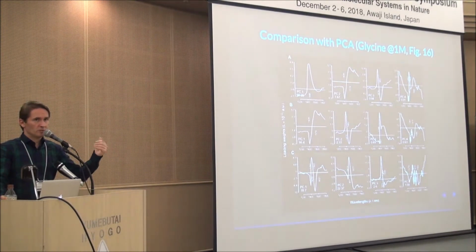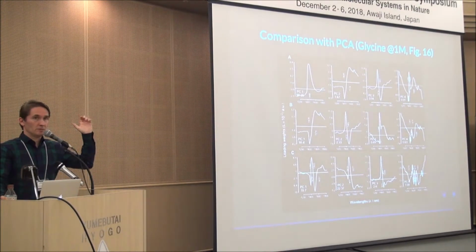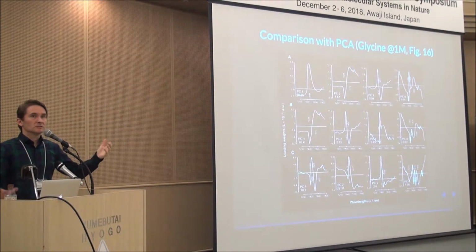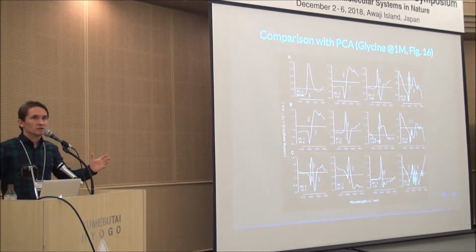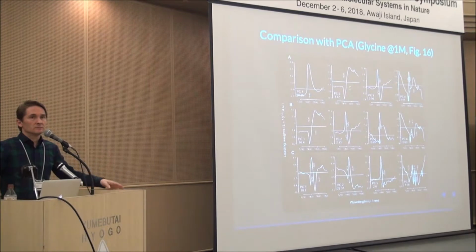And if you want to make a model practically useful, the number of principal components just skyrockets. So it's unstable. There is a trade-off, in my experience, between having real spectra, and now it's, I think, a couple of hours anybody can do. If you do, I'll explain.